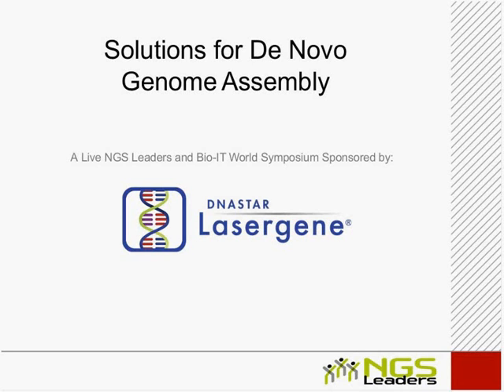And finally, for now, before we bring in Josh, second speaker, just say a little bit about the Assemblathon, Ian. You mentioned it in passing, but there may be some people in the audience who are familiar with what you've done there and where they can find some of the first tranche of results. There is a website, assemblathon.org, that shows what we're working on in the project. Assemblathon 1 has been completed. That was using synthetic simulated data, and Assemblathon 2 has 3 different organisms, a fish, a bird, and a snake, that is actual real data, and we're still in the middle of analyzing that data. And we welcome people to join in on that if they like.